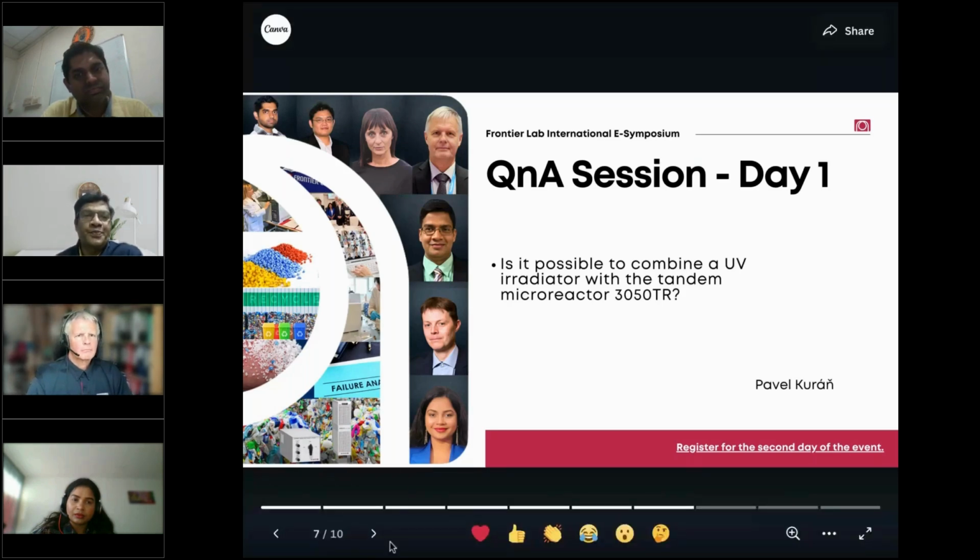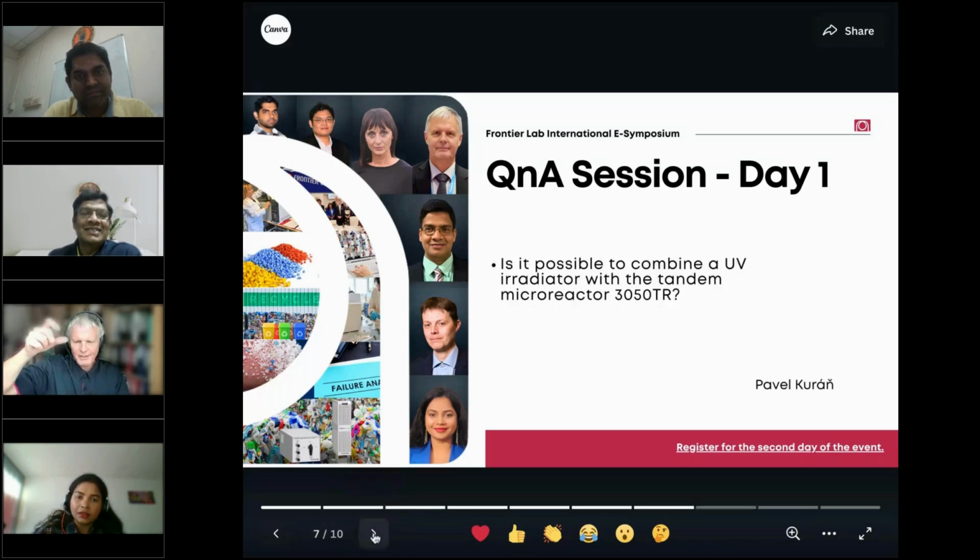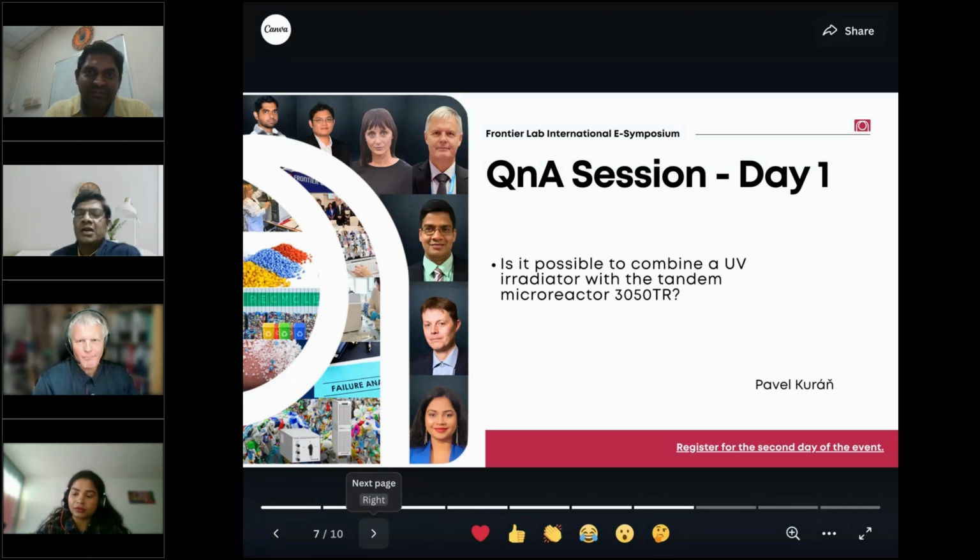Yeah, I think it's also a question of technical design. The lengths and everything, this UV sampler and this protection tube, must really fit. So I'm not 100% sure. Yeah, absolutely. We have to refer back to our team. Yeah, maybe Frontier should look at this.